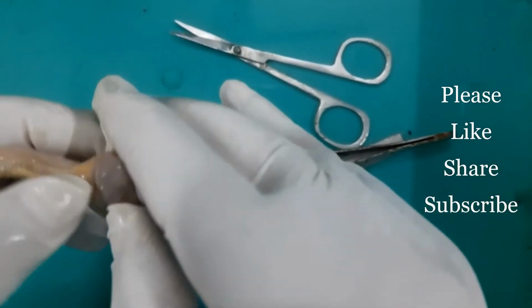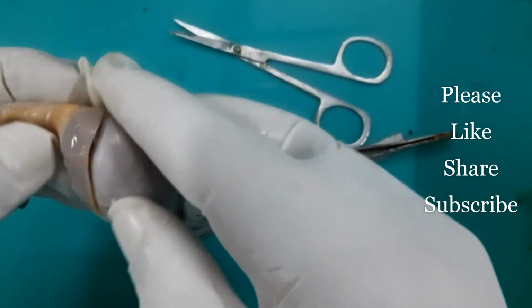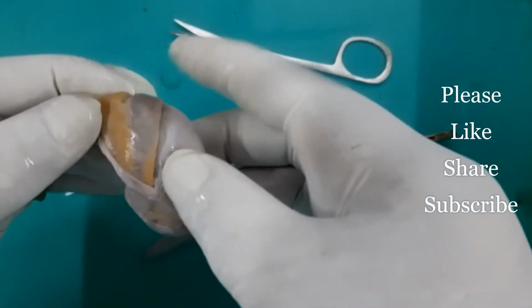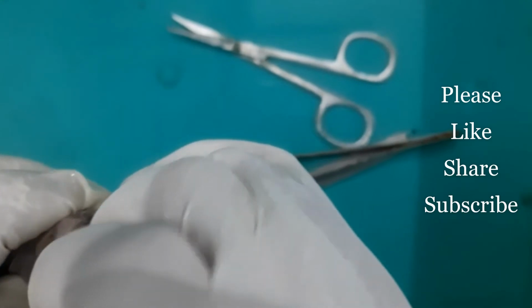And I will show you the parts of the epididymis also. This is the head of the epididymis here, then this is the body. And let me expose the tail of the epididymis also.